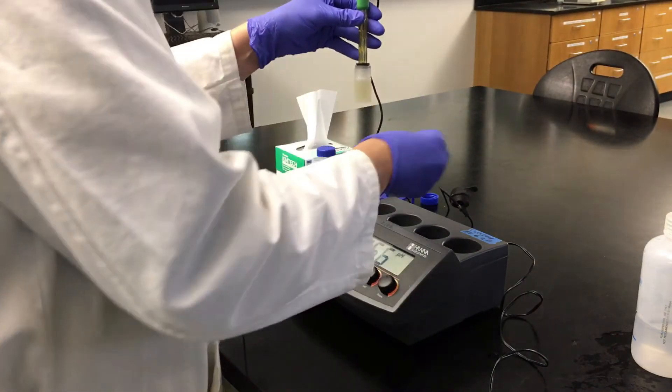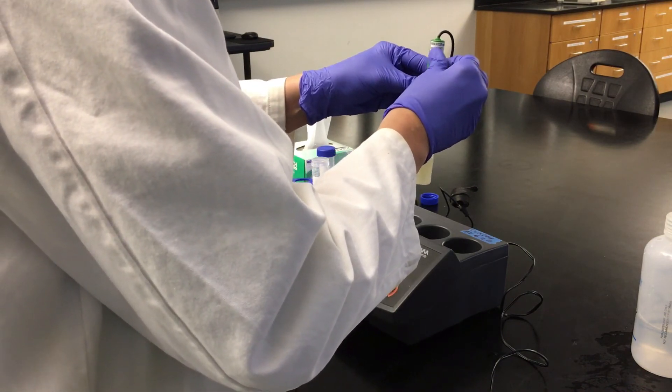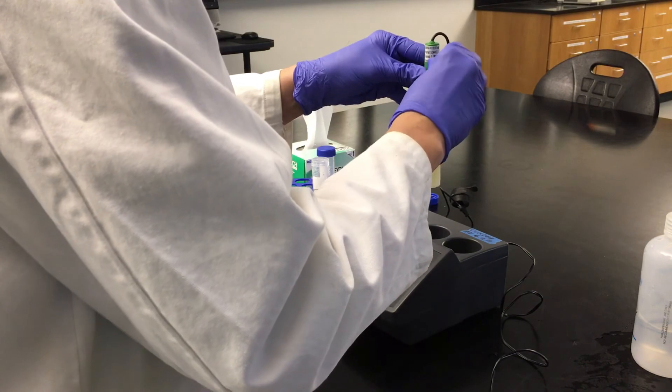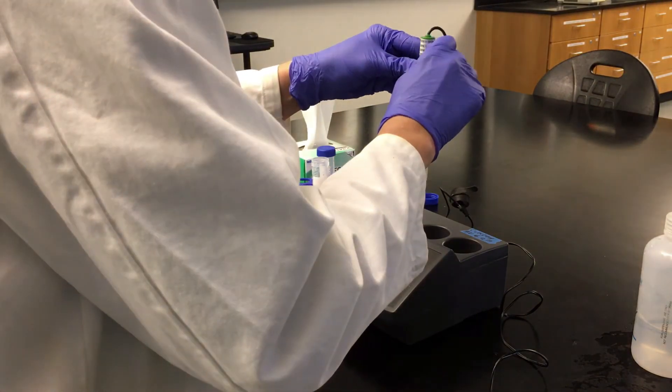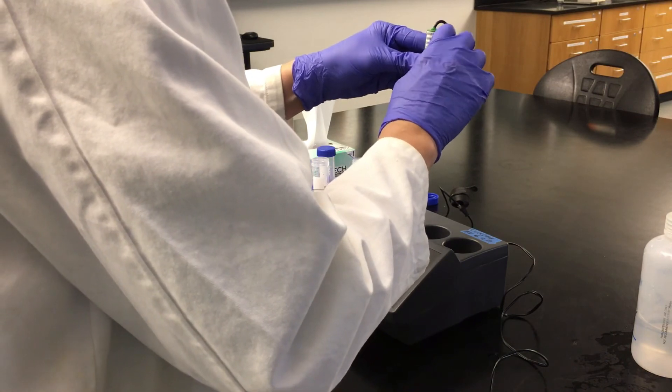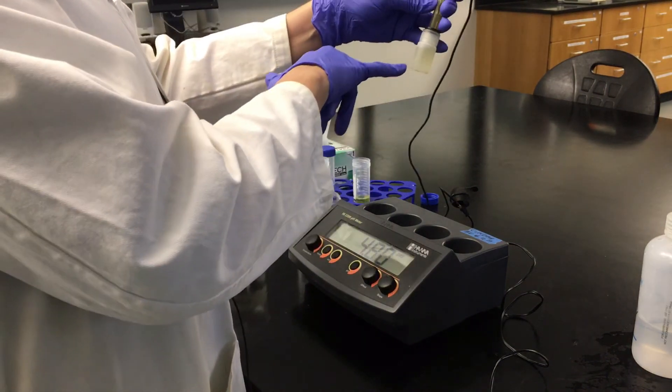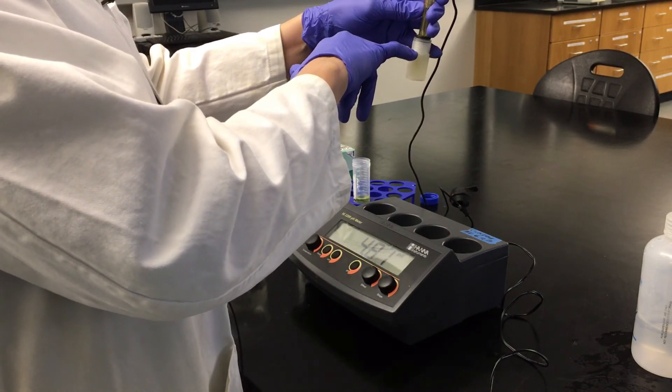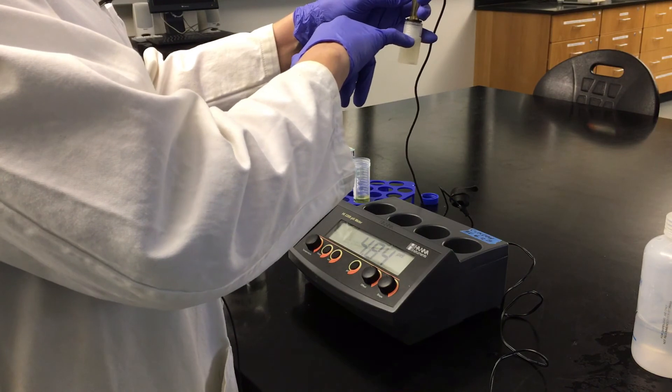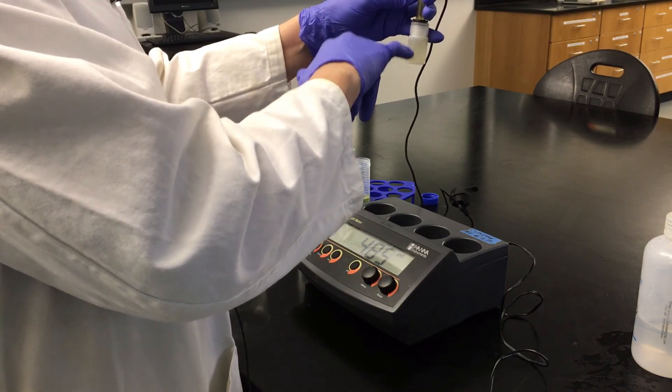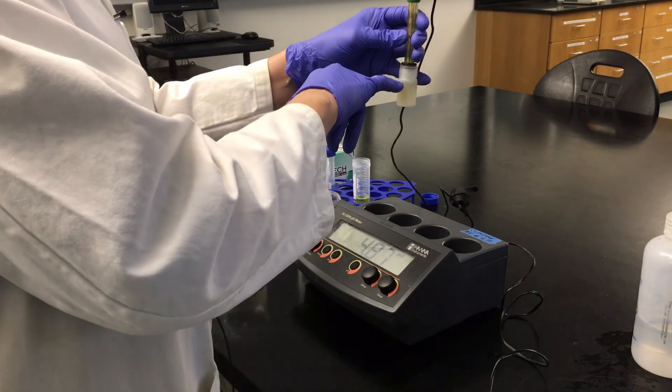Return the cover to the fill port. Make sure that there's enough solution in here that covers both the bulb and the junction. If for some reason this bottle has spilled or you've lost some solution, we're going to need to refill it.